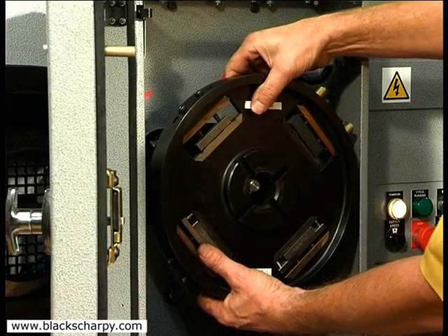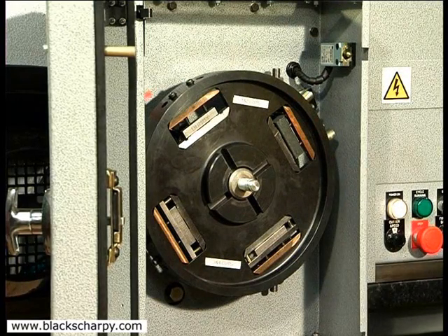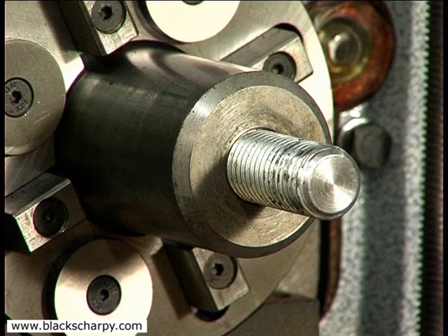The fixture is now loaded into the machine with the two cam stops positioned towards the top right hand corner. Do not worry about this exact position, as the keyways in the fixture and the drive keys on the drive spindle will finally position the rotating fixture.